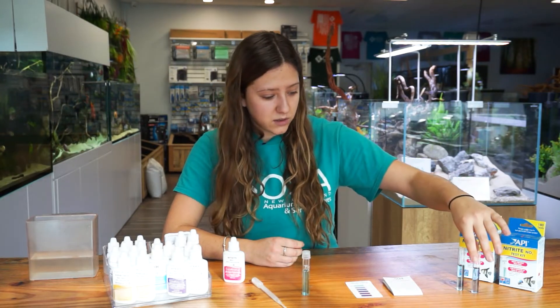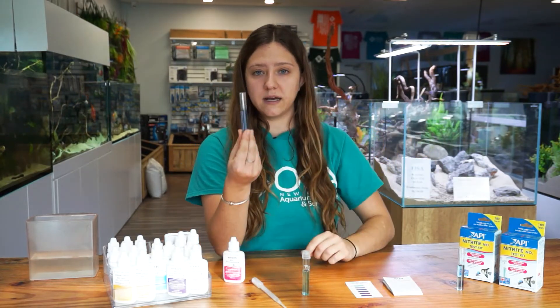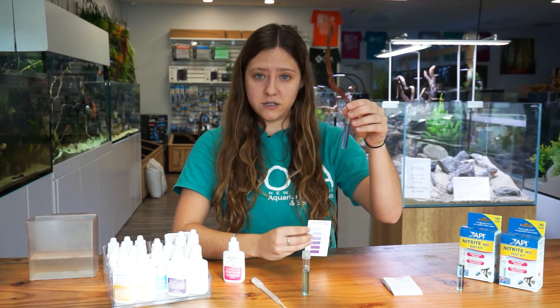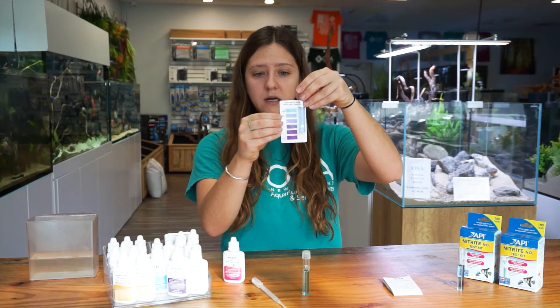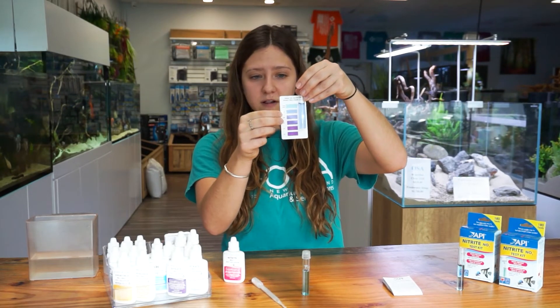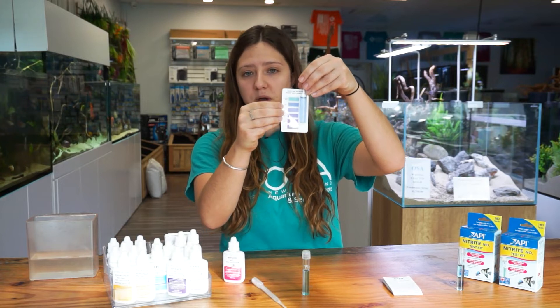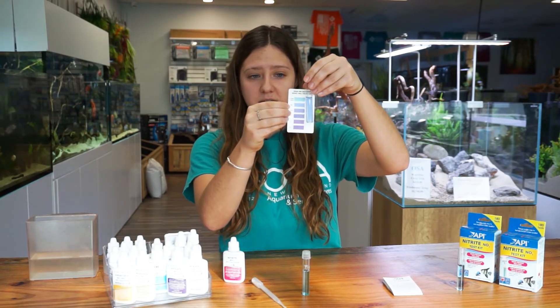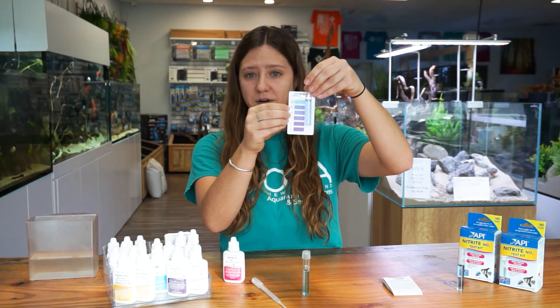I did do a test on a tank that we are cycling, and it does have just a little bit of ammonia. When you want to read your test kit, you want to hold it up against the white of the card and see which color it matches up to. This one matches up just barely to the 0.25 parts per million, so that's how we know how much nitrite is in that system that I tested earlier today.